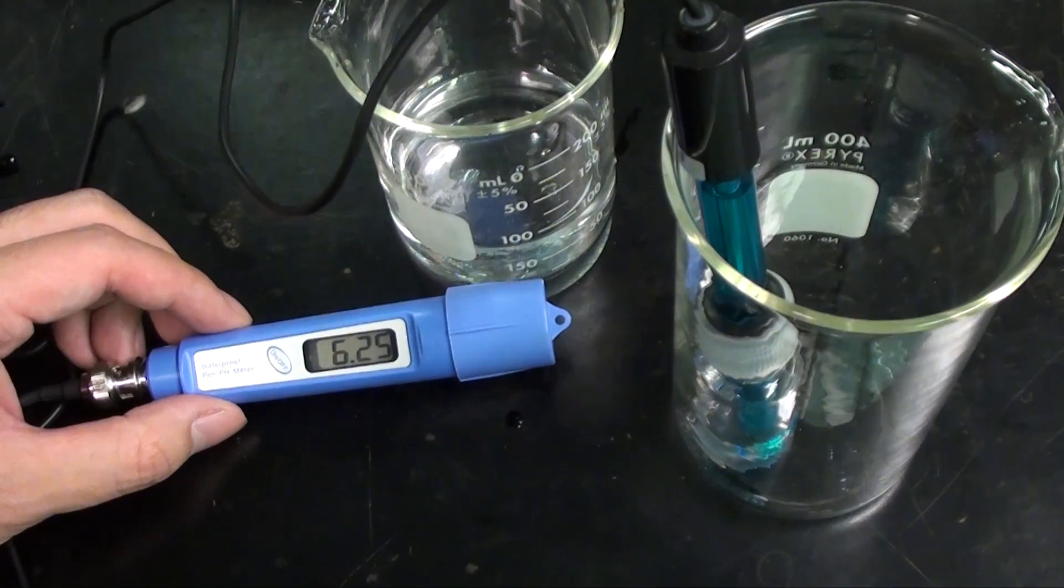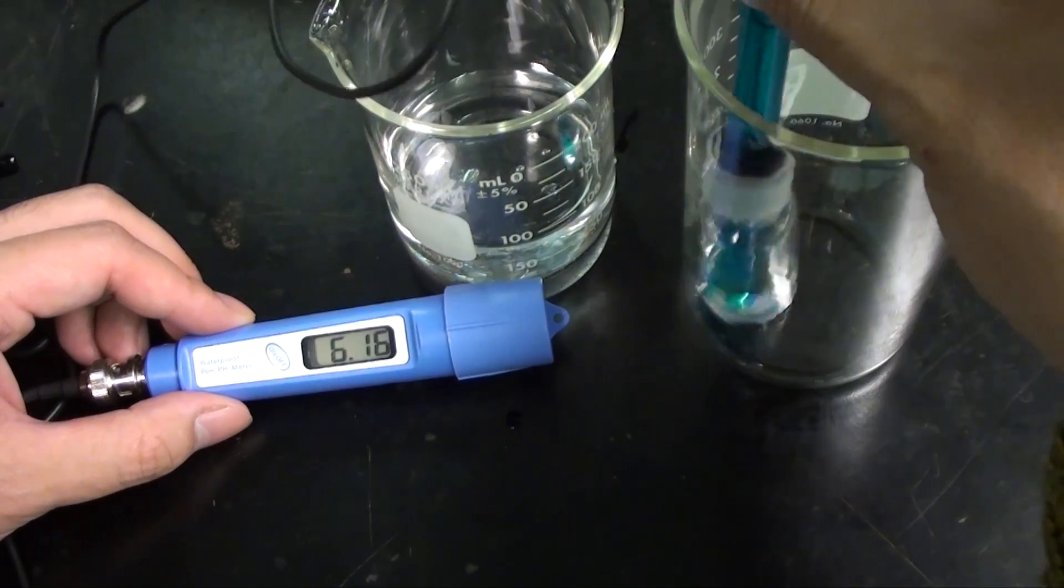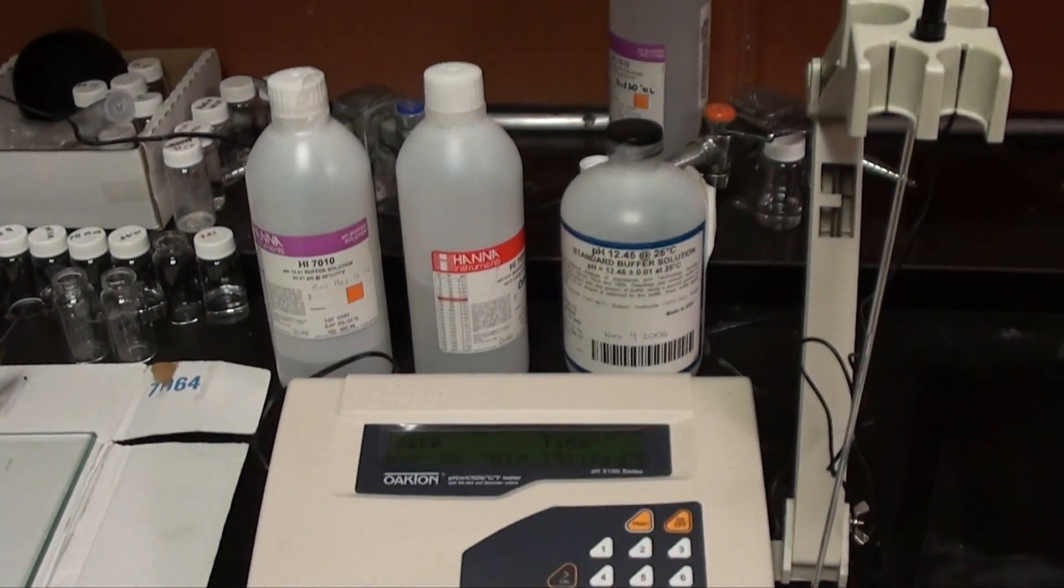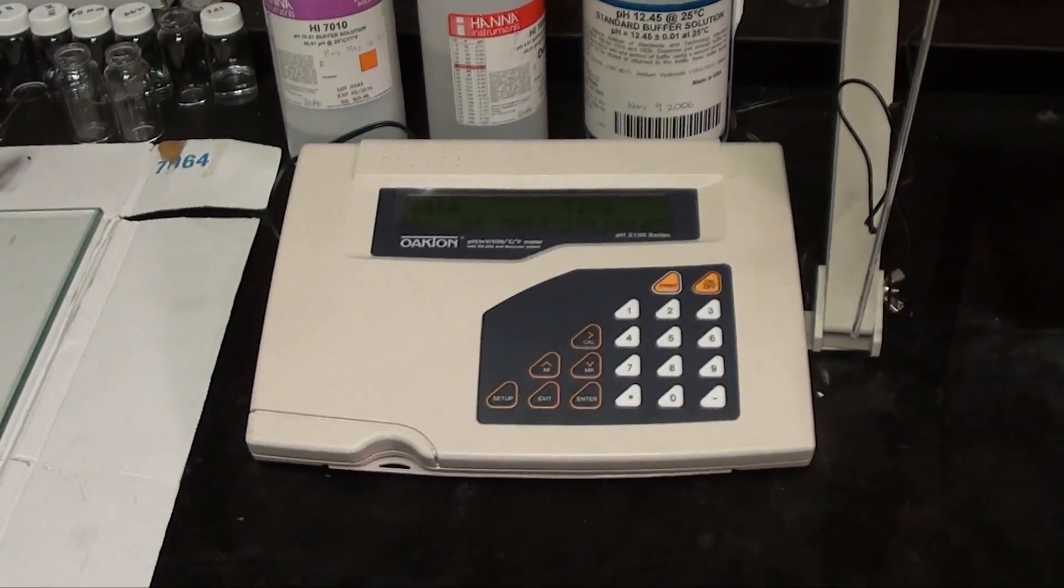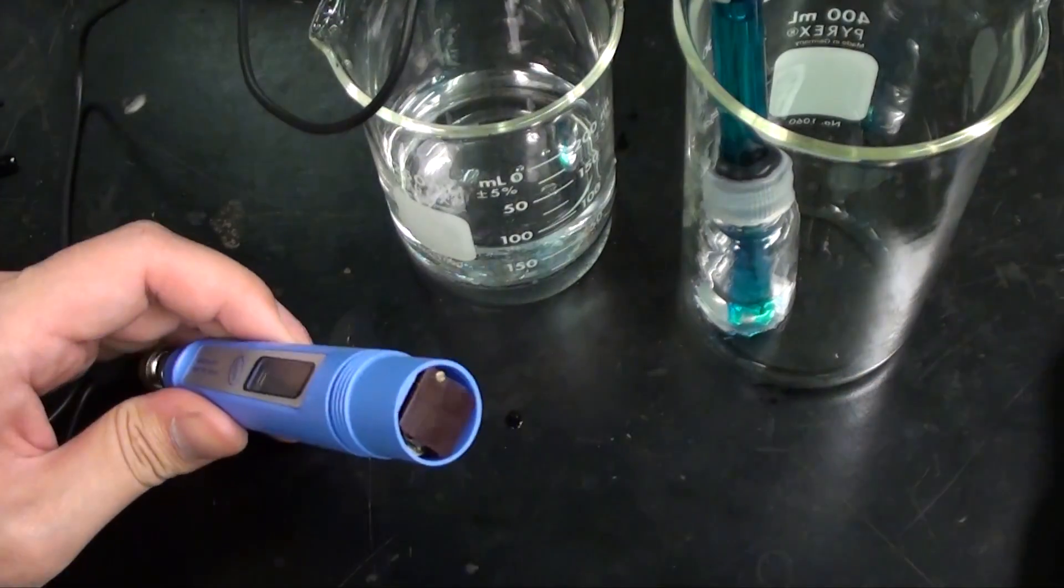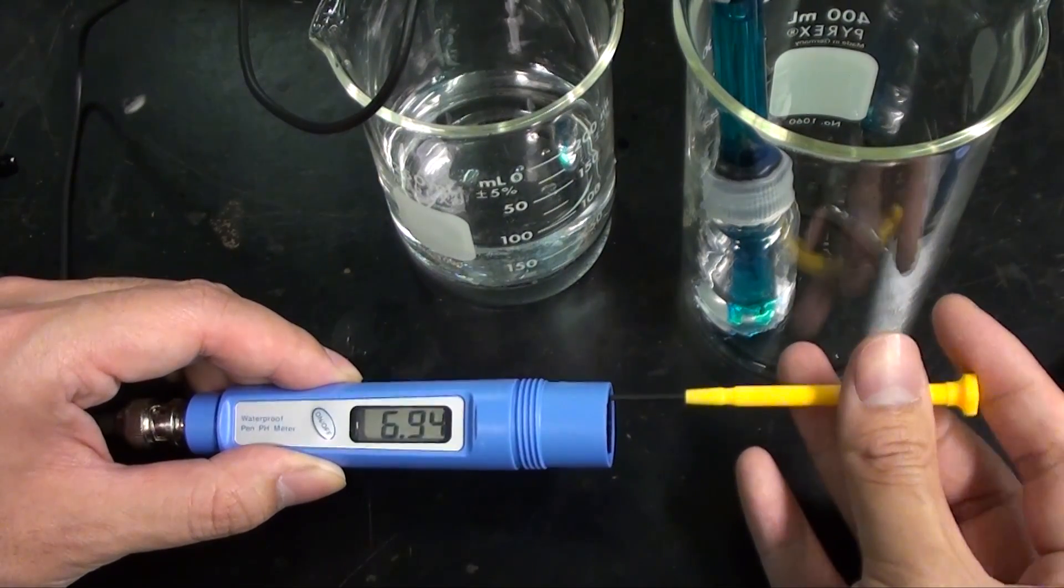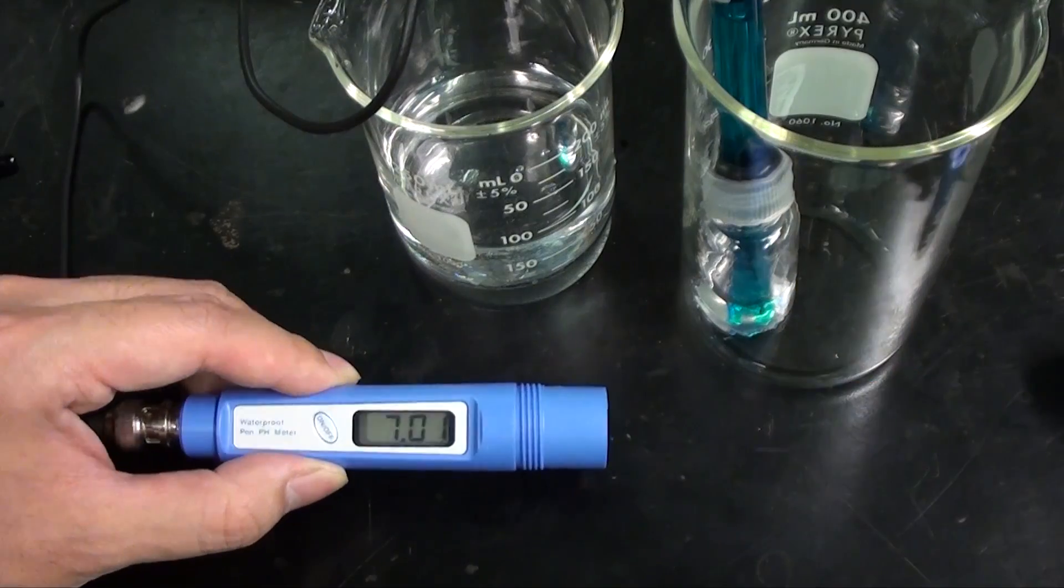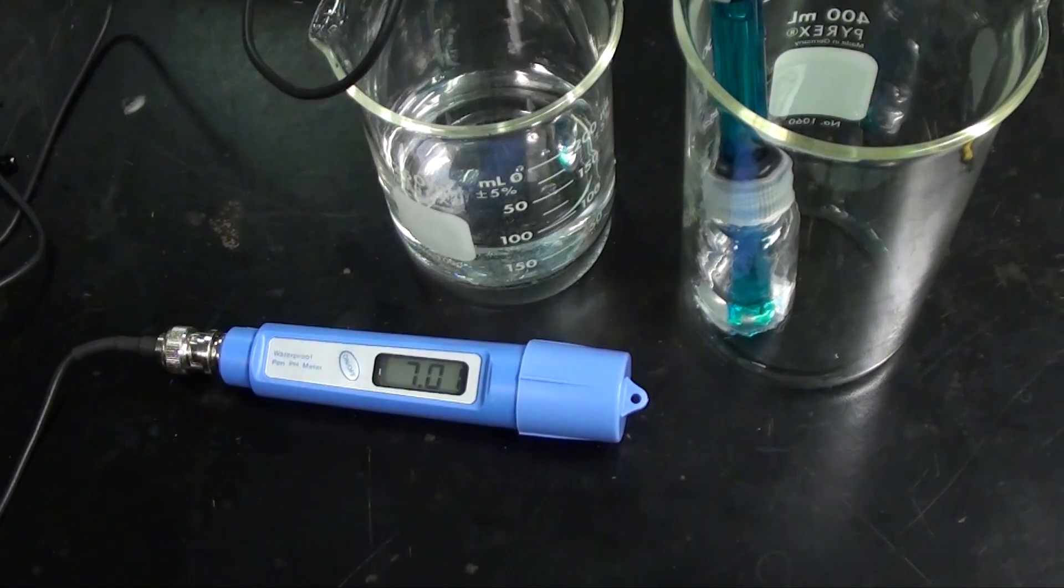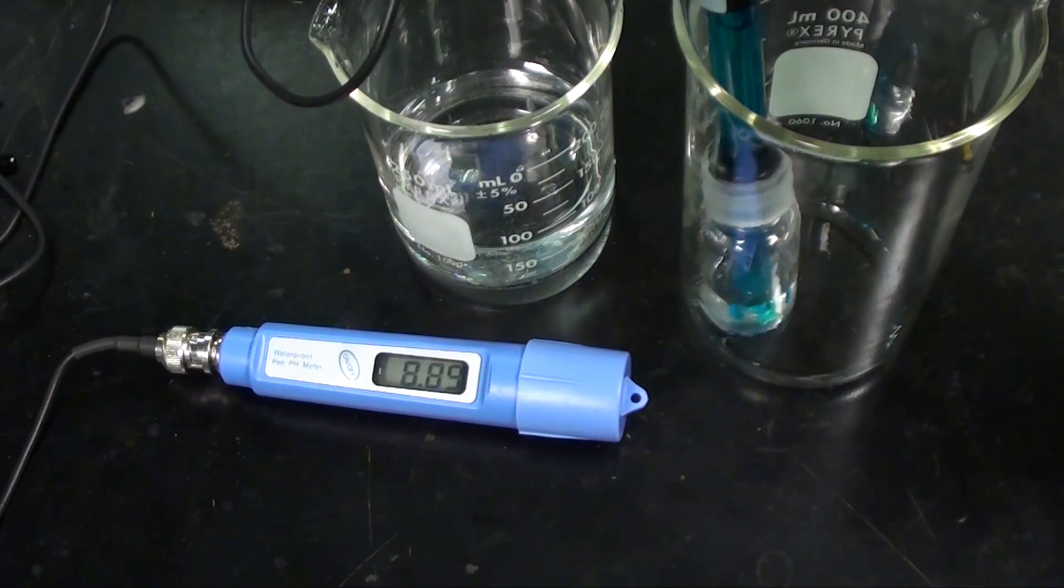As you can see the electrode has drifted quite a bit since its last use, so we need to reset it. On an expensive meter we can just press in the right commands. On the smaller ones there is usually an adjustment screw or similar that we can use. Let me adjust this one here. There we go. We've now calibrated this pH point to its proper reading.